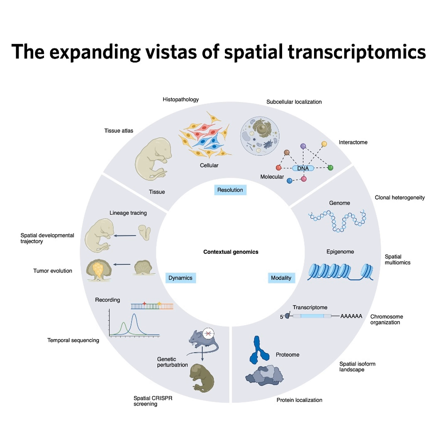There are also microfluidic approaches, like DBiT-seq, that use tiny channels to deliver barcodes. Okay, so you either print defined, fairly large spots, or you create millions of tiny, dense, often randomly placed points and figure out their addresses later. But either way, you end up with gene expression data tied to specific coordinates.